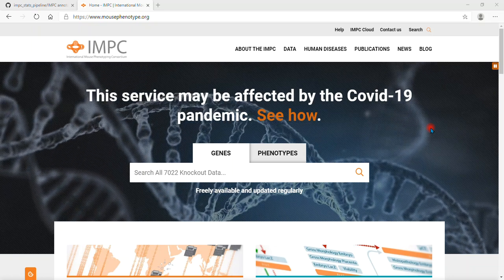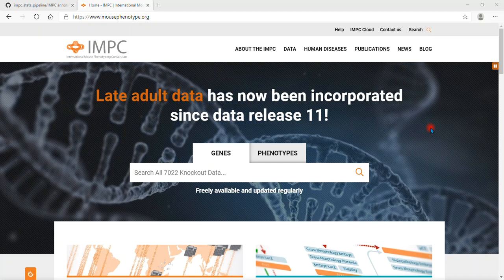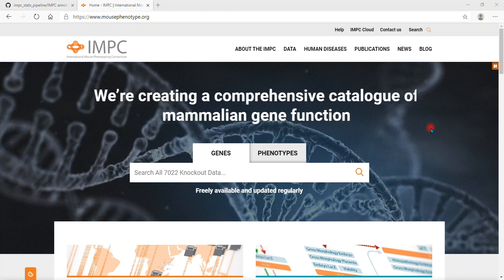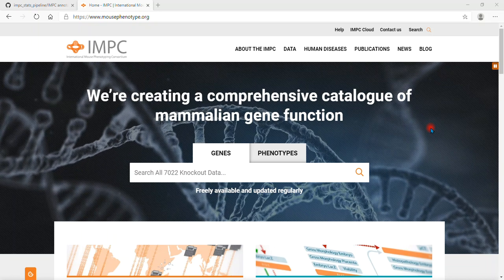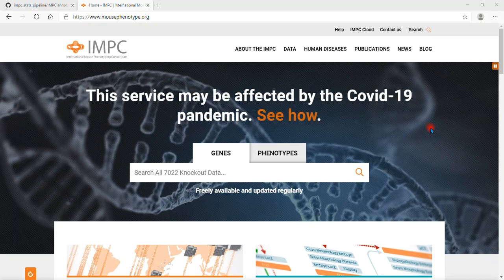In this program, I'll show you how to run the IMPC annotation pipeline. IMPC stands for International Mouse Phenotyping Consortium, and we have a website, which is www.mousephenotype.org.